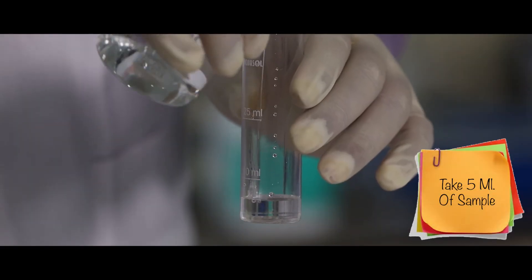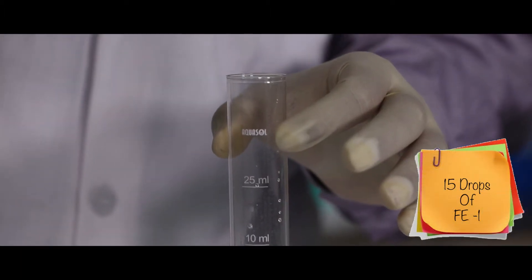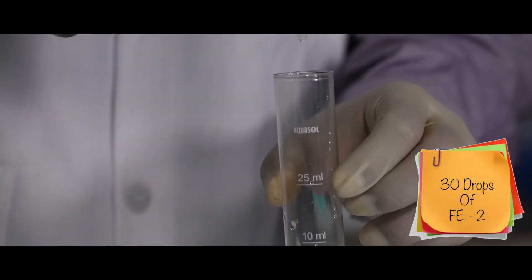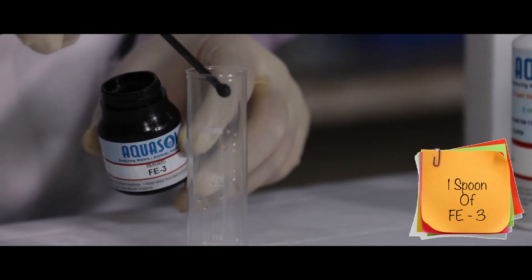Start the test by collecting 5 ml of sample. Add 15 drops of Fe1 reagent and 30 drops of Fe2 reagent. Add one spoonful of Fe3 and mix well.